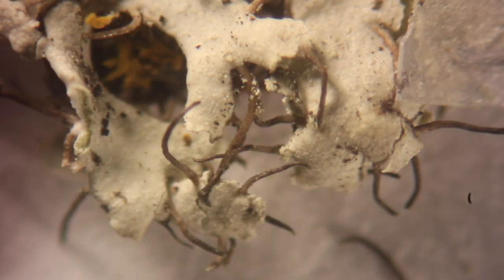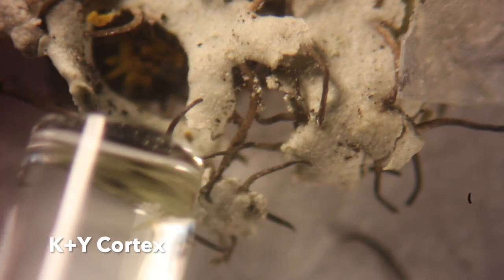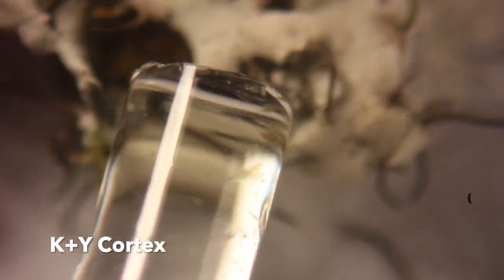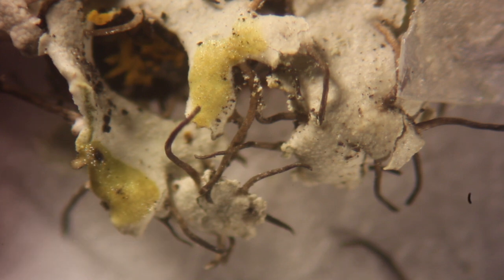We already saw what a K plus P reaction looks like. Here's an example of a K plus Y reaction on the cortex of Physcia. This is also a pretty quick reaction, and you can see the cortex clearly yellowing.